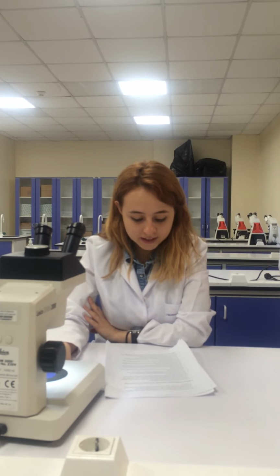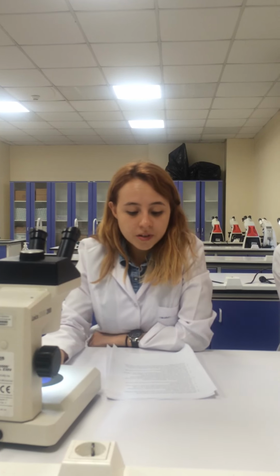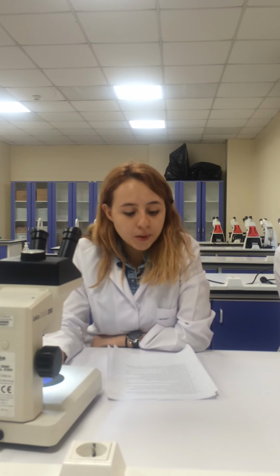The second step is alizarin red S staining for differentiated osteocytes. At day 14, osteocyte induction medium is removed from 6-well plates with differentiated osteocytes, and the plates are washed twice with phosphate buffered saline. Osteocytes are fixed in 10% formalin solution for at least 10 minutes.